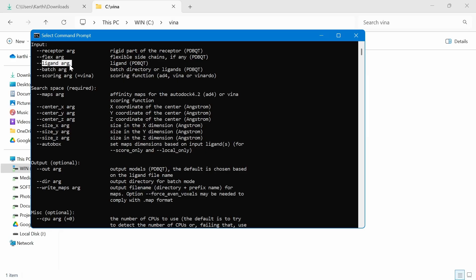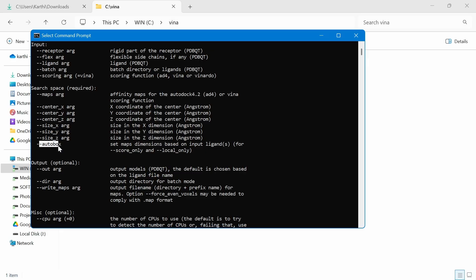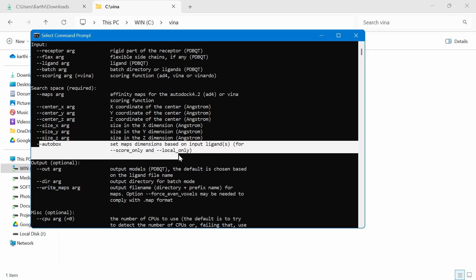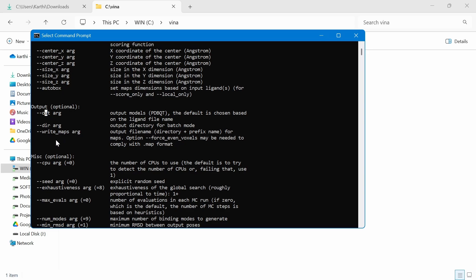The input files are receptor, ligand, and other parameters. You can see in this help section there will be many arguments and commands available.